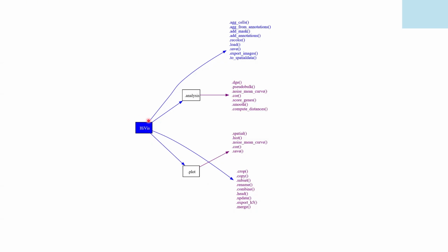So you can take the AnnData from the HiVis, you can work on it, for example, do a single cell analysis pipeline with ScanPy and so on. Then you can merge it back into the HiVis AnnData and go back to this. Additionally, you will have some options to work with QPath. I will show you when I talk about the QPath area. And if you work on fluorescent staining, you can recolor, so all the plots will be very nice.